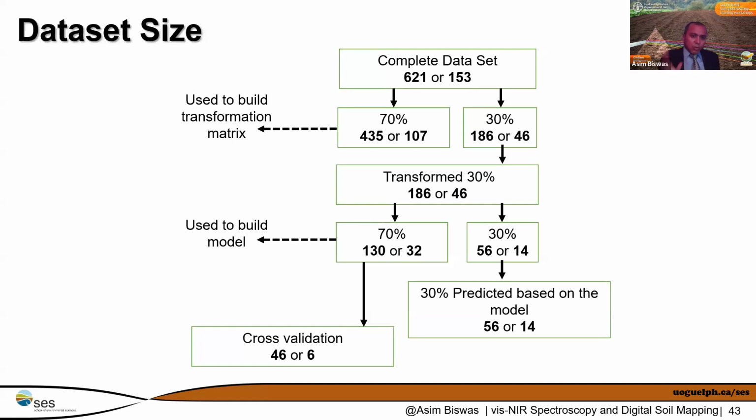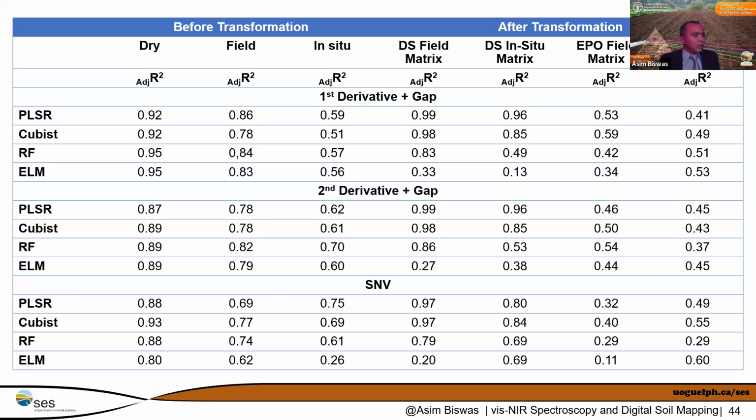So again, we ran both as a sample and as a profile. When validating, we wanted to see both approaches and their difference, whether we keep one sample out for cross validation or keep one profile out for cross validation, because of the connection between the soil horizons, so we can often take one soil horizon as one sample. This is where you can see those numbers. The first number is the physical sample number, and the second number, 153, is the soil profile samples we have. And again, it's a very busy table.